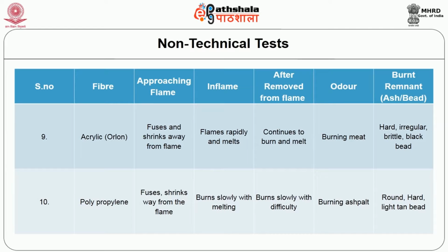Regarding acrylic fiber, it fuses and shrinks away from the flame while approaching the flame. In the flame, it flames rapidly and melts. While removing from the flame, it continues to burn and melt. The odor is like burning meat. The bead is hard, irregular, brittle and black.